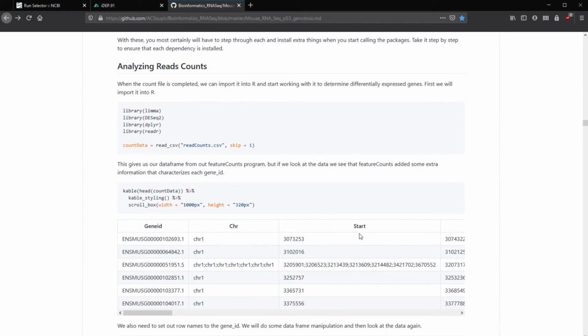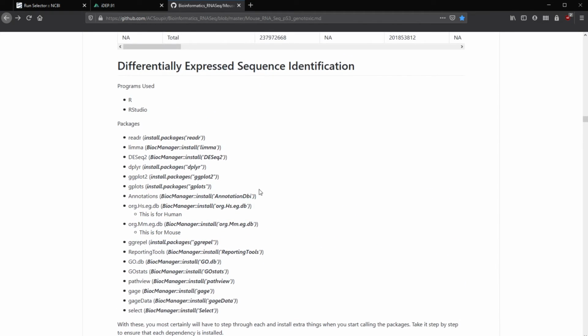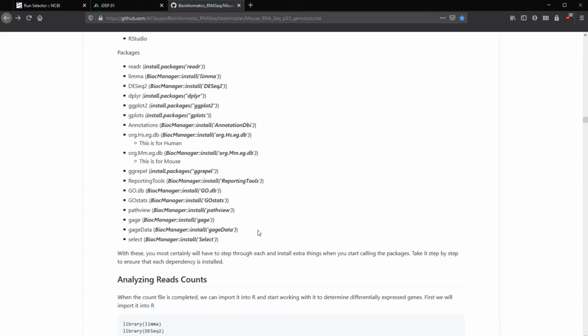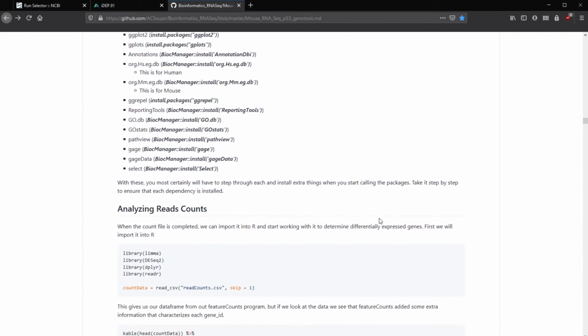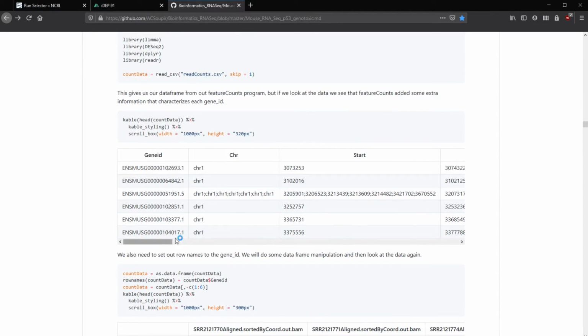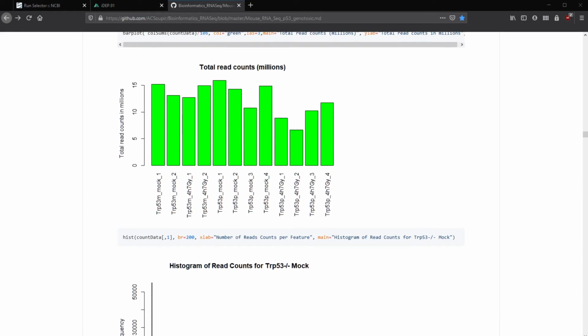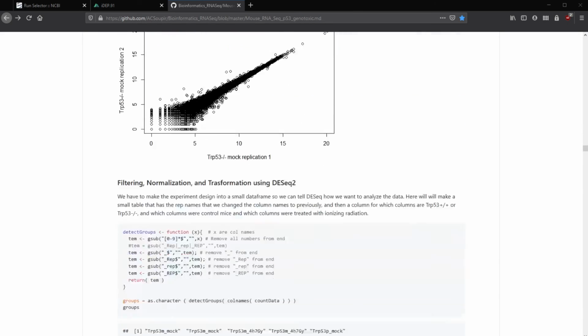Later on, we'll go on to a little bit different things. Right now for work, I'm trying to do some splice correlation, figuring out what groups or what cancer patient responses correlate to a particular splicing variation of a gene. So later on we can talk a little about that too. But if you want to read through some of this and explore on your own, feel free to do so. I named them a little bit different here, gave them actual names, but there's some more explanation on here as well.